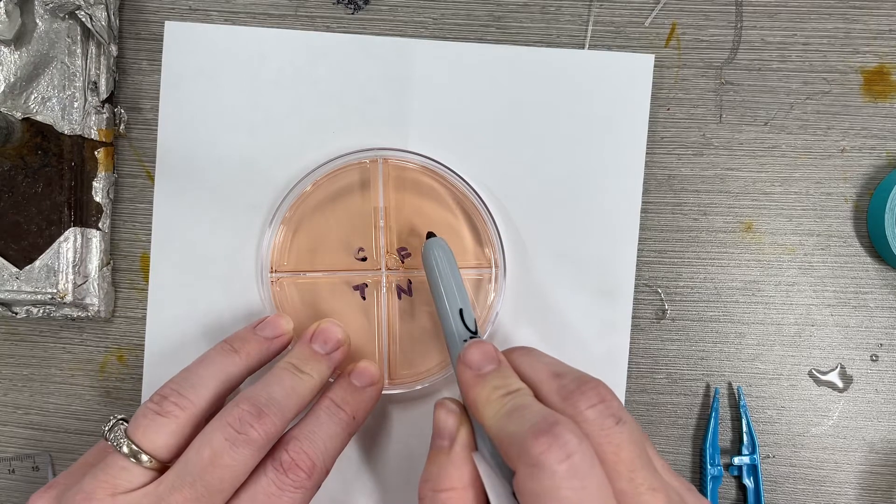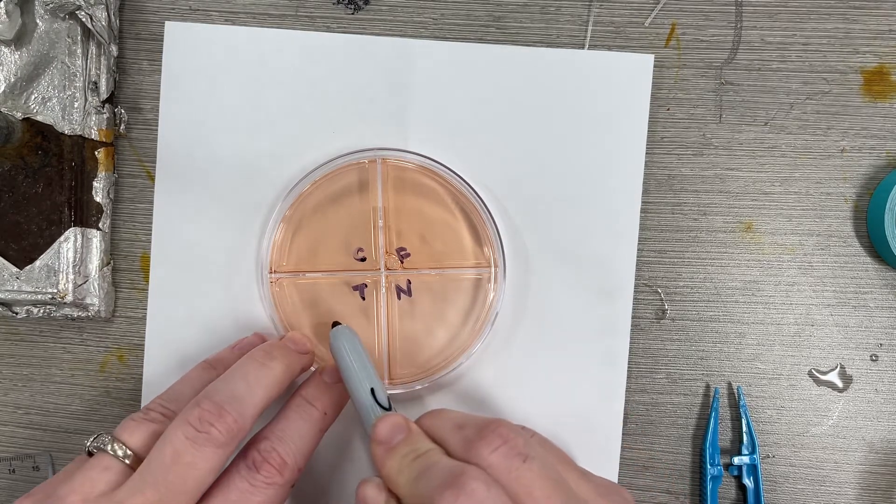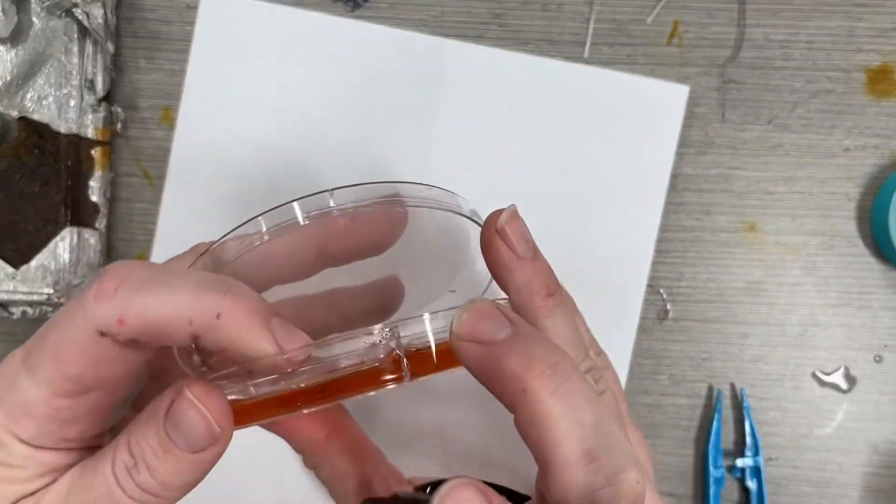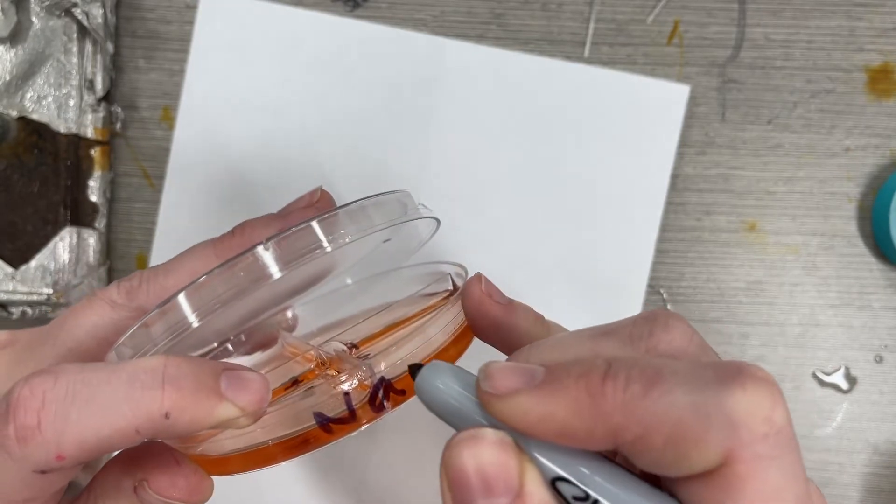So I'll put my control which is nothing, my fresh fruit juice here, my canned fruit juice here, and my meat tenderizer solution here. I'm going to carefully take my time on this and write my group names right here.